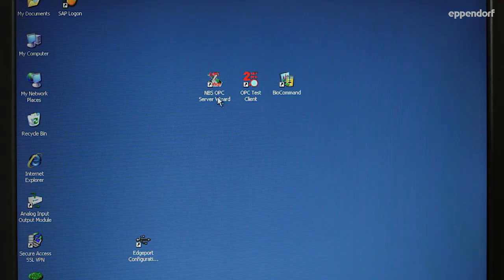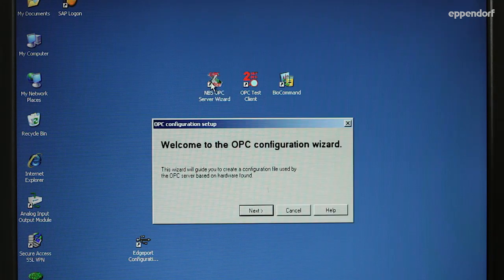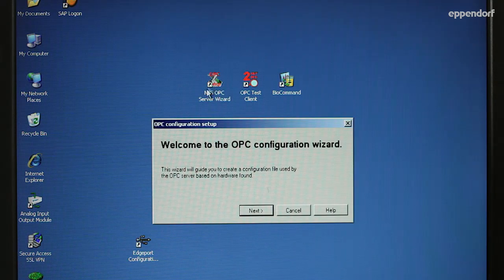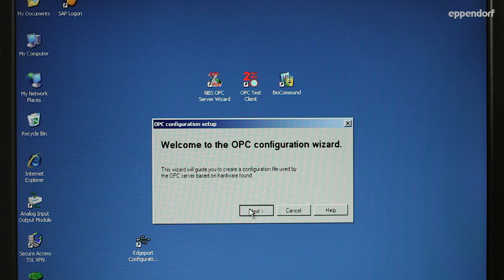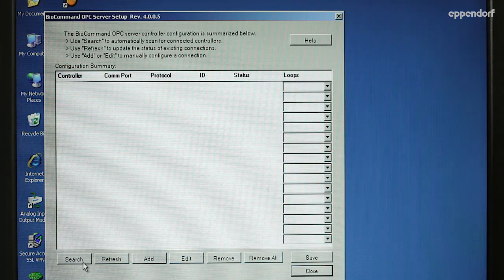Open the NBS OPC server wizard. When the program window opens, click the Next button to display the main window.